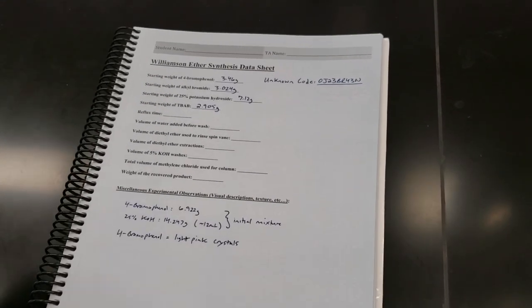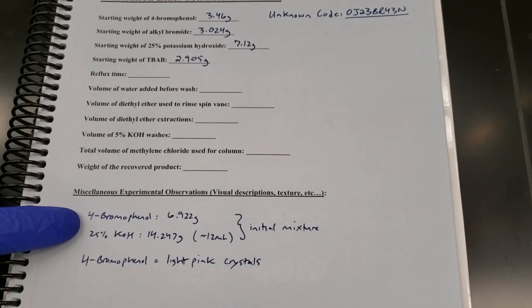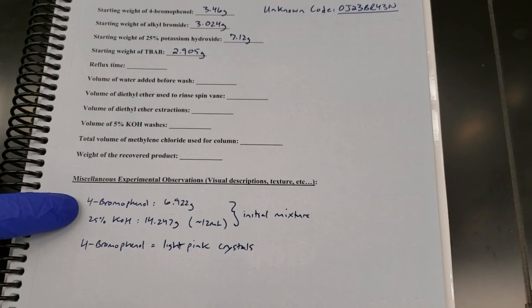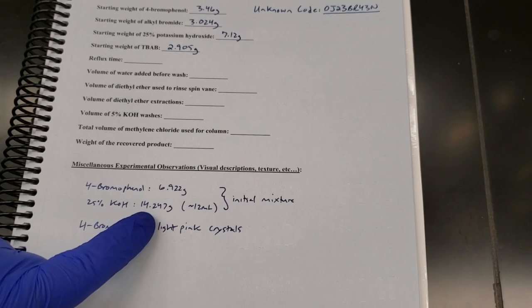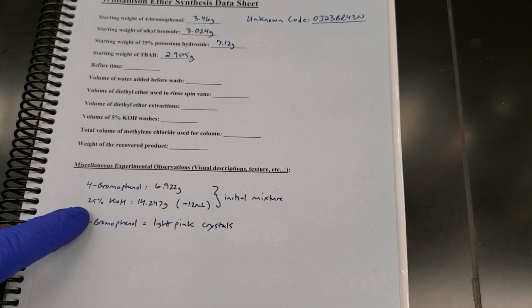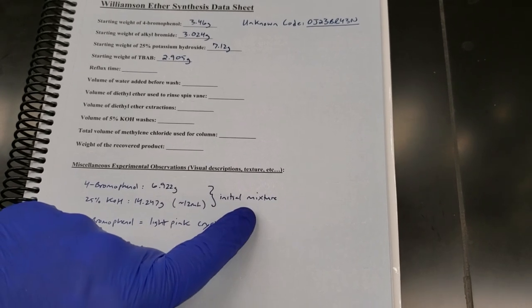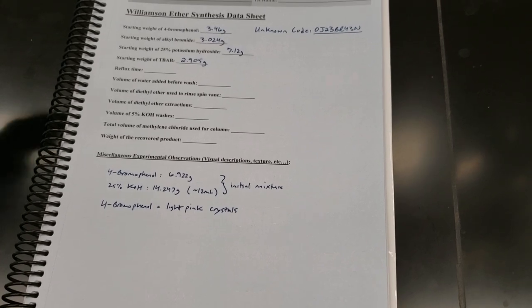We've got a lot written down in a very short period of time. So initially, we started out with 6.922 grams of our 4-bromophenol, and that was dissolved into 14.247 grams, approximately 12 milliliters of our 25% KOH. That was our initial mixture. But that's not the actual weights that we're going to be using for our reaction when we're doing our calculations.